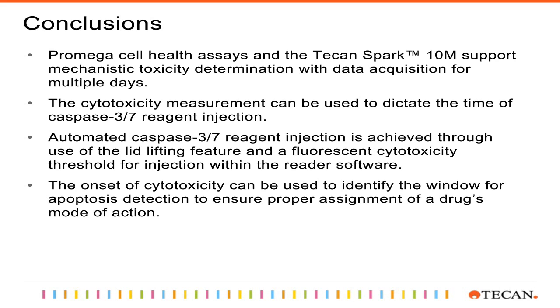Automated caspase 3-7 reagent injection is achieved through the use of the lid lifting feature and a fluorescent cytotoxicity threshold for injection that we used within the reader software. And lastly, the onset of cytotoxicity can be used to identify this window of apoptosis detection to ultimately ensure proper assignment of a drug's mode of action or mechanism of action.